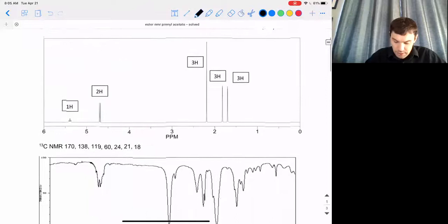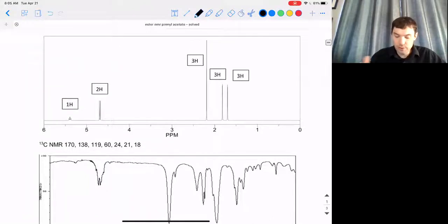The next thing I usually tell folks to do is to try to identify all of their key clues, and of course it's easier said than done. The reason is, after you look at 1,000 NMRs, you'll have a good opportunity to recognize some patterns, and the unusual things will kind of just pop out at you. Unfortunately, when you're starting out, there isn't a great way to recognize what the unusual peaks are until you build up that familiarity. So that's kind of what we're here to help with.